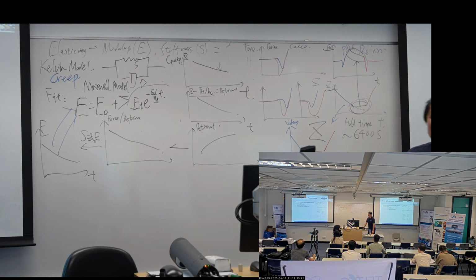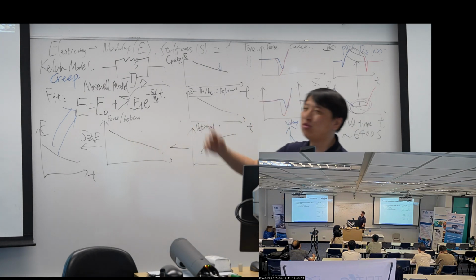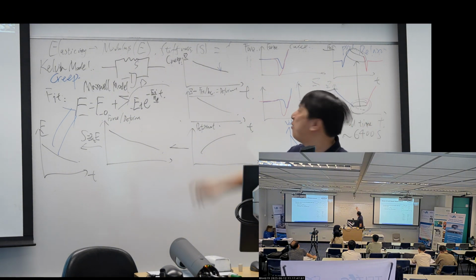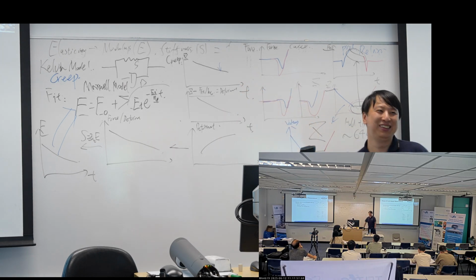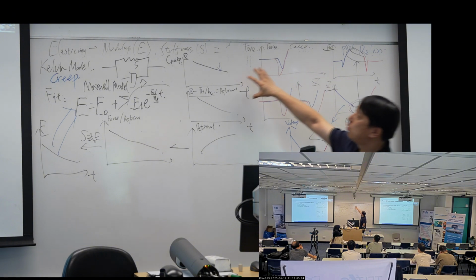Maybe we will develop the algorithm in the software later. But nowadays, we'll stop here. And JPK is the same. They stop here. That's about the creep.